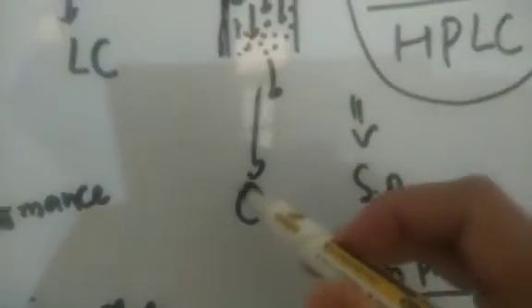But last point, the components that come out from here are detected. Not usually like the TLC method we use there, here we usually use detectors, and those detectors are UV visible detectors. They can be electrochemical also, but usually UV visible detectors. So we can check the peaks. We get peaks through the chromatograph.